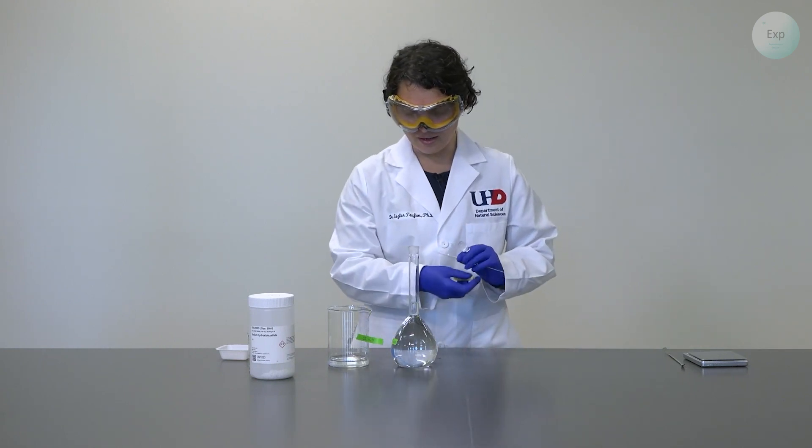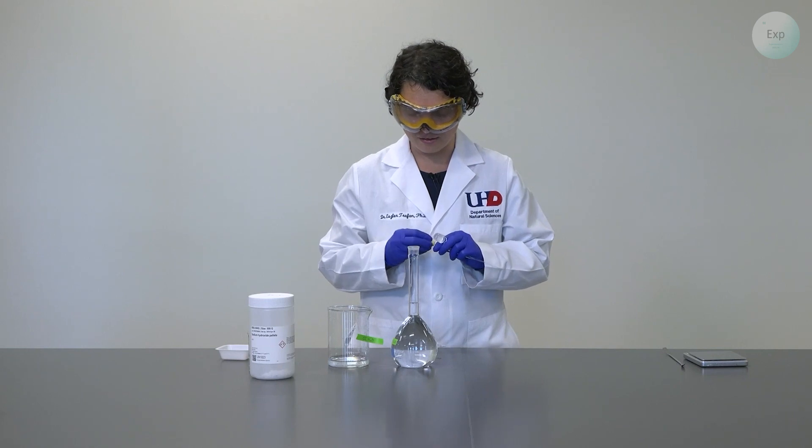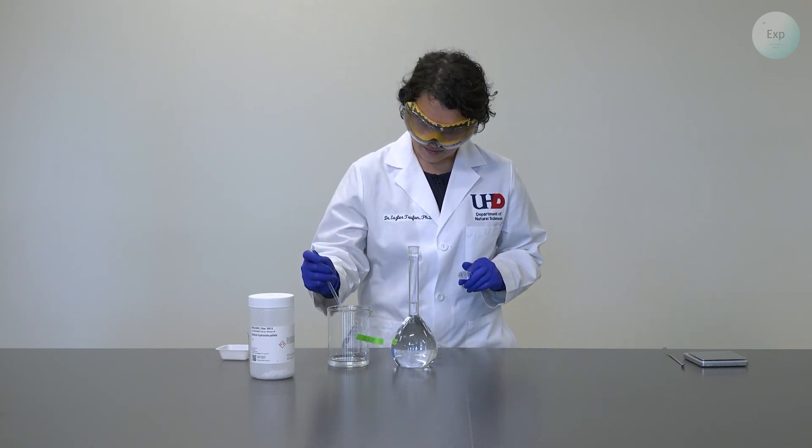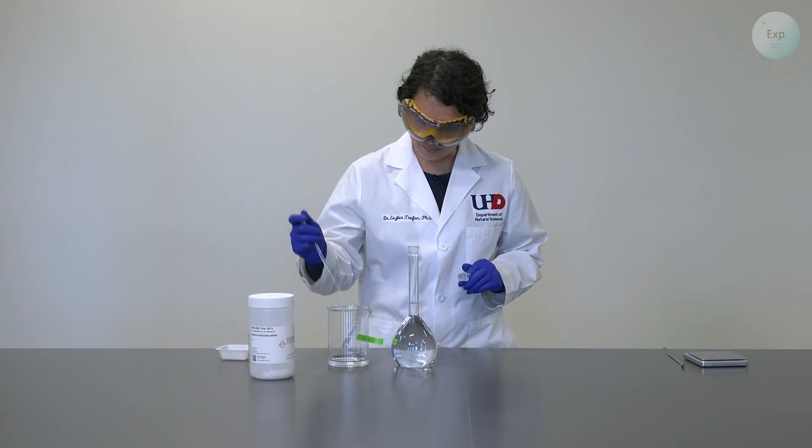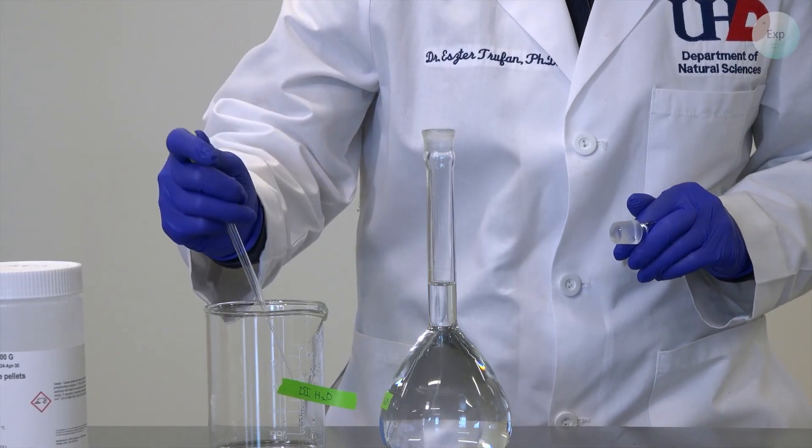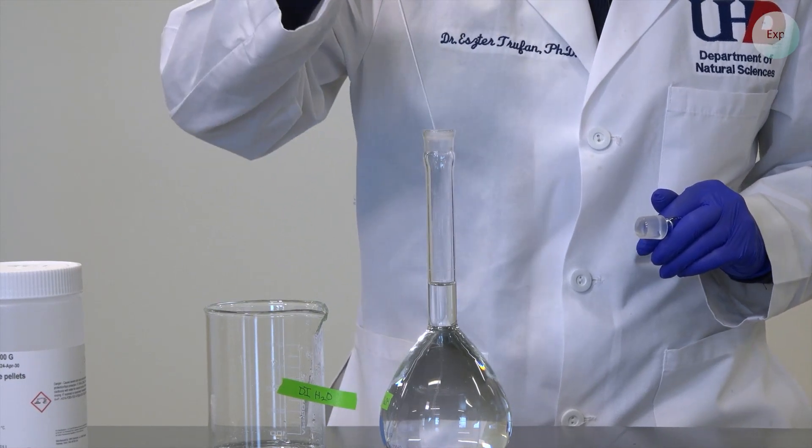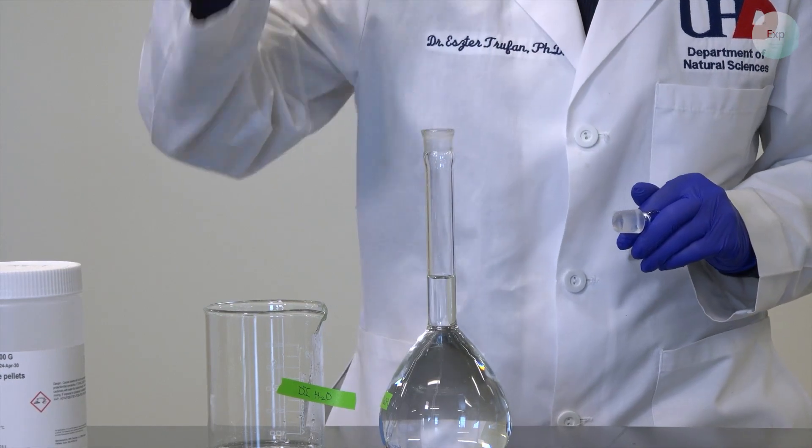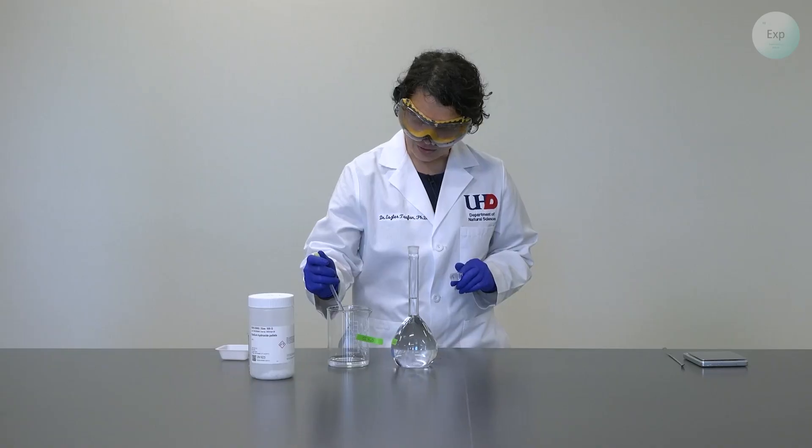And now we are approaching the neck of the flask and approaching the mark on that neck. So at this point, I'm not sure if I can accurately add the right amount of deionized water. So I will switch to a pipette, extract some deionized water from the beaker, and then transfer it into the volumetric flask. Once I get really close to the mark, I will lower myself to eye level and make sure that the meniscus of the solution is exactly at the mark.